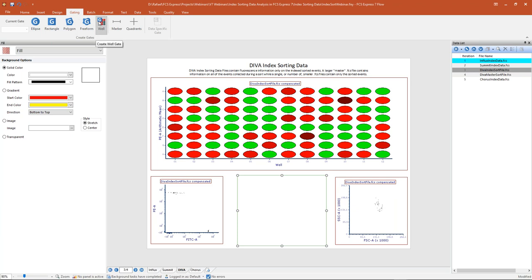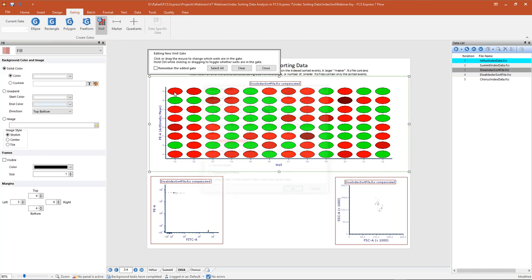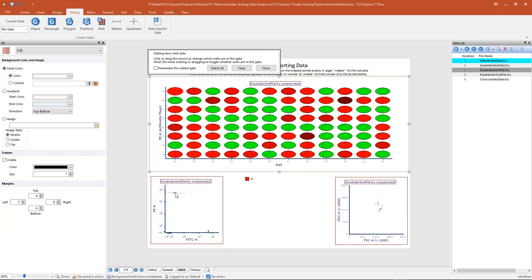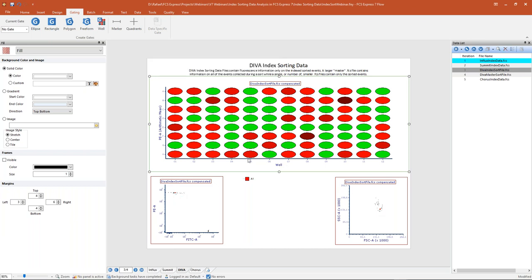With the DIVA index data, I'll go up to the gating tab and create a well gate. In this case, I'm only going to grab one specific well — well A1. I'll call my gate 'A1,' leave it as the red color, and check the box to emphasize on my plots. When I click OK, you can see that well has been created and is backgated on my plots with our single event appearing in red on those colored dot plots.